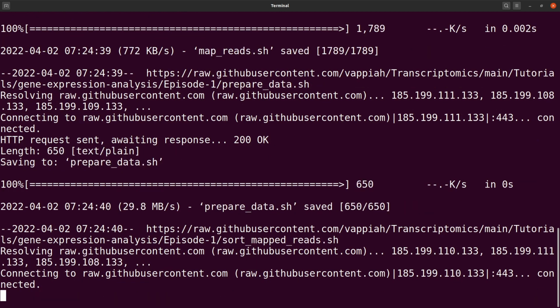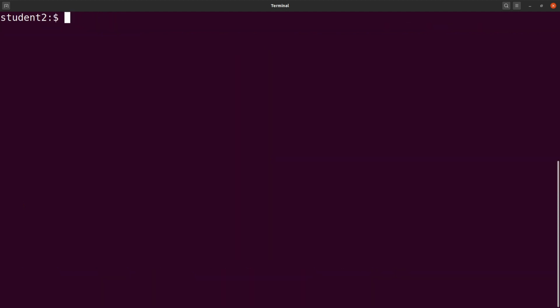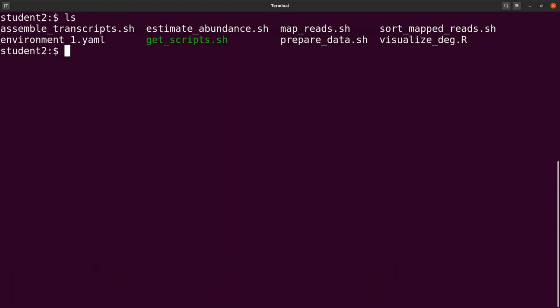Okay, so download is being done for us. Perfect. So all the scripts that we need have been downloaded. So let's clear the screen and check them out. So do an ls and you'll find them there. I will explain what each script or file does as we move along.